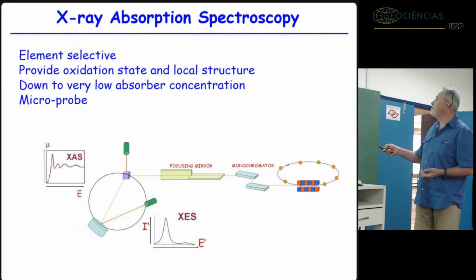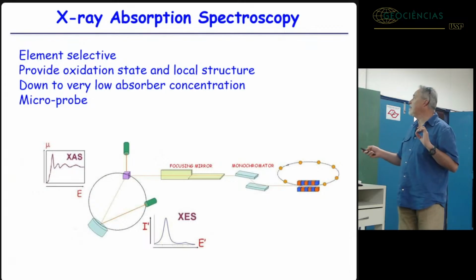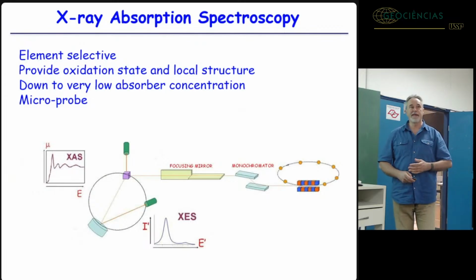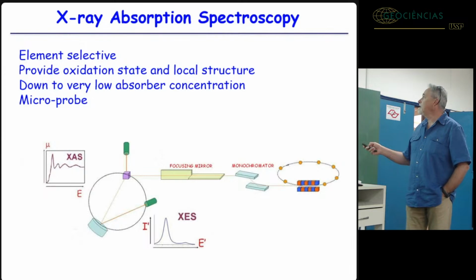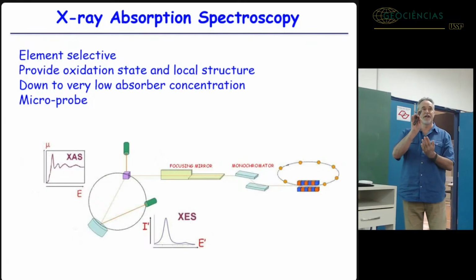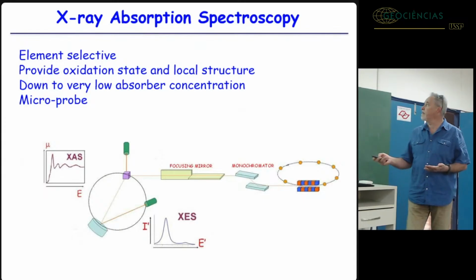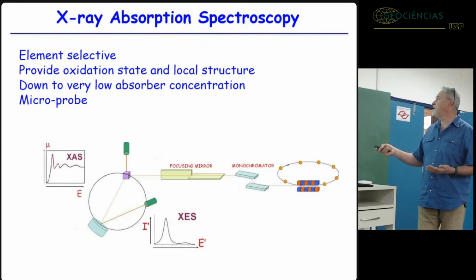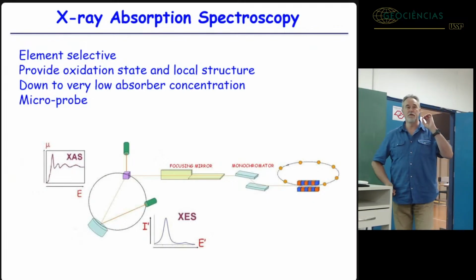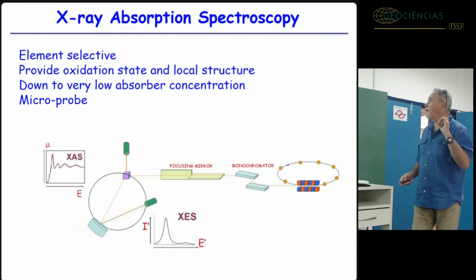There is a device which allows creating a very strong and fast X-ray beam. This X-ray beam possesses a lot of different energies, so usually a couple of crystals, or even more, are used to select which energy you want to use and to be able to scan our sample with a range of different energies. There is a possibility to focus with mirrors down to less than 1 micrometer, so it's possible to do microprobe as well.